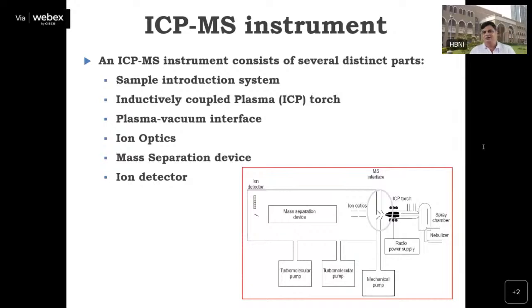Yes, it is definitely possible to give the detection limit. Otherwise, why would this manual be there? But again, you have to use the conditions which have been defined. So definitely one can achieve it, and we are achieving it also.